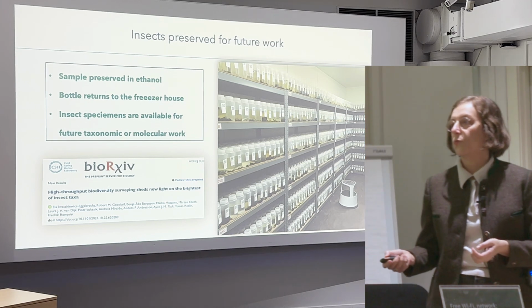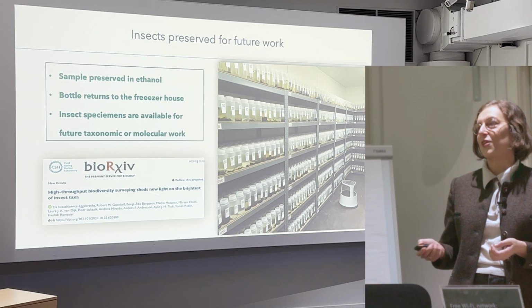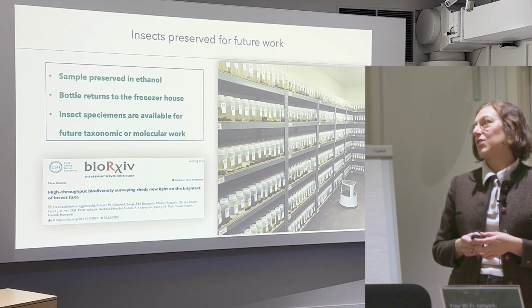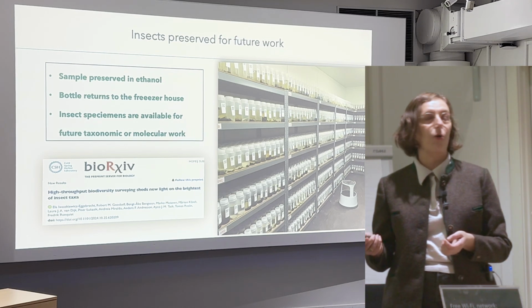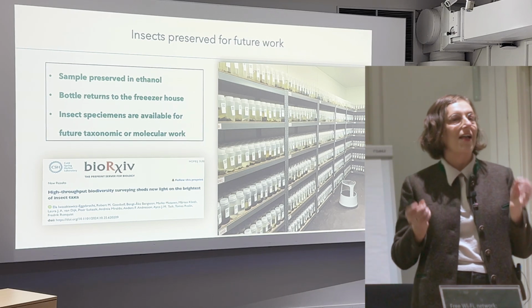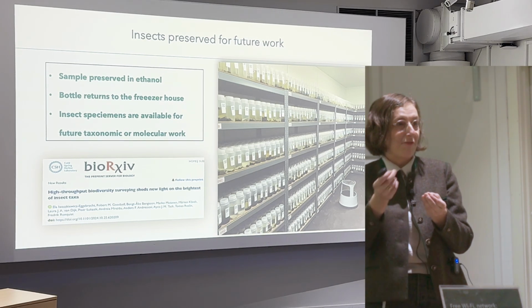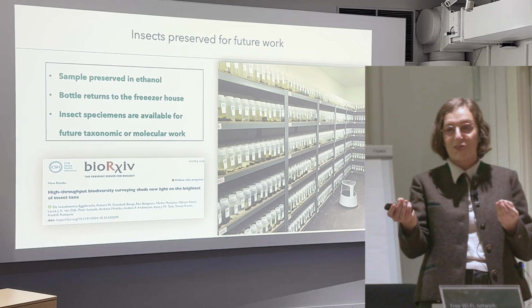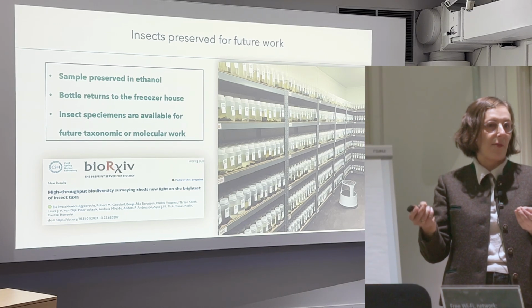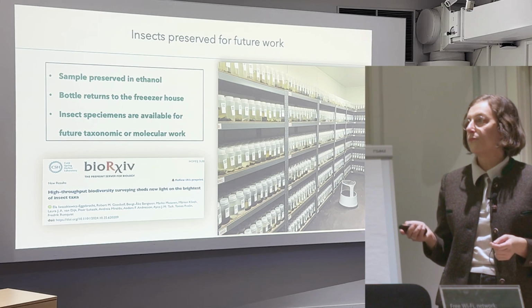We just looked into some results about Lepidopterans, just a snippet. We came back to samples that had some interesting Lepidopterans in them, verified, and sent them to a specialist to look at, to verify that our sequences really match something interesting in the physical sample. And this is an example of how it can proceed.